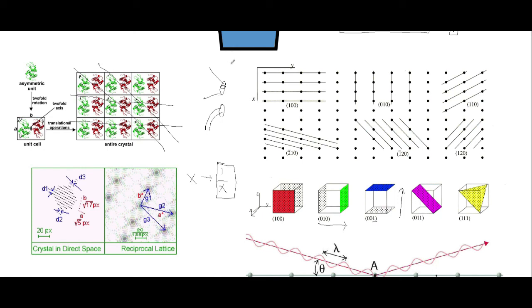And so that's an intuitive way of thinking about it: when you reduce the size of these holes, you're going to get much higher spread. It's going to become wider, whereas here, if we just think about it right out of the hose, it's a nice straight line with our larger opening.